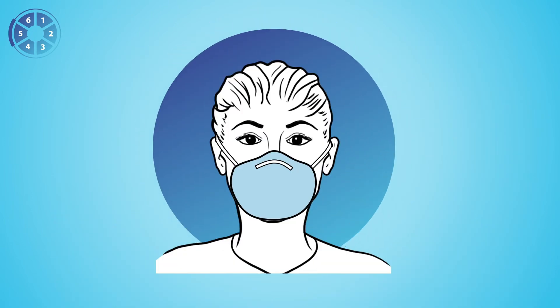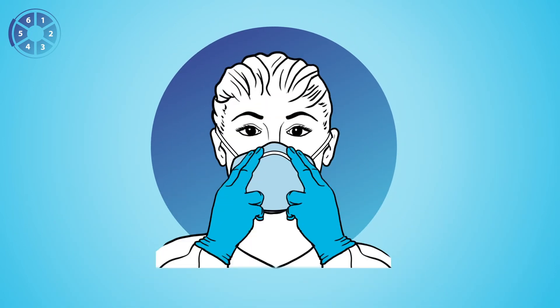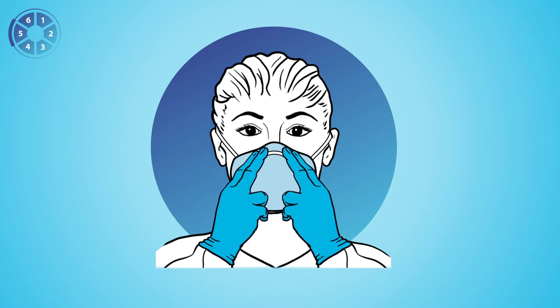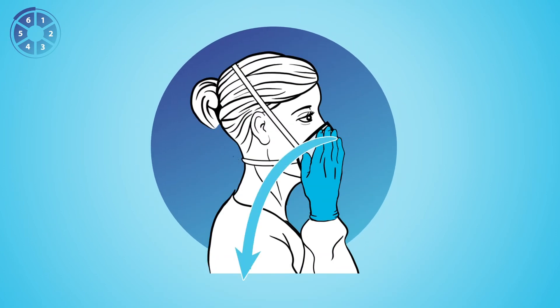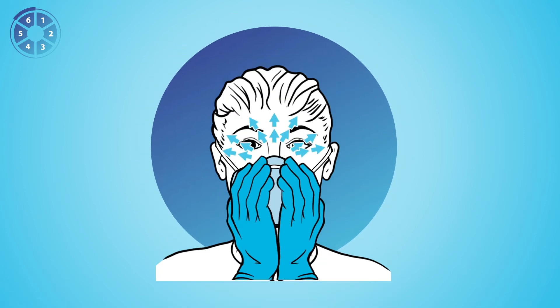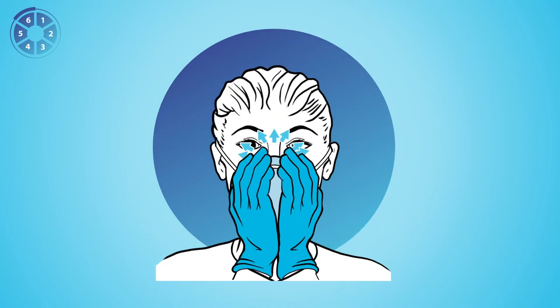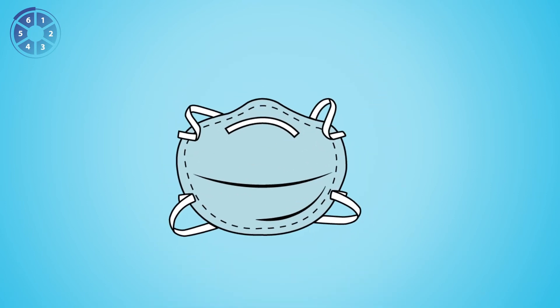Five, use both hands to mold the nose strips to conform to the shape of your nose by pushing the strip against your face while moving your fingertips down along both sides of the nose piece. Six, perform a user seal check to confirm that your mouth and nose are covered by the respirator. If you have a leak during your user seal check, reposition and try again. If you fail to get a seal, you are not protected. Follow your institution's protocols for obtaining a new respirator.